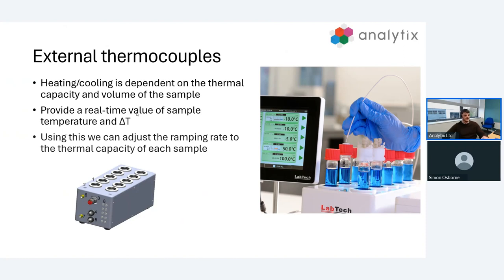With these external flexible thermocouples, we connect them to the back of our module. Each one of those inlets represents a cell. We connect our thermocouple here and push them through a rubber septum in the lid of our vial. This maintains the seal while allowing the thermocouple to be within the sample. During our reactions we're getting a real-time value of both the temperature of the jacket and the sample temperature. It also provides us with a delta T, or the difference in temperature change between the sample volume and the temperature of the jacket. Using delta T, we can then adjust the ramping rates to suit the thermal capacities of each of your samples.